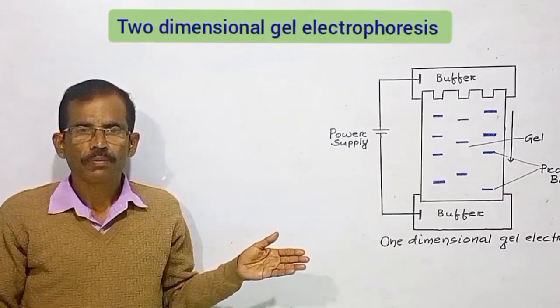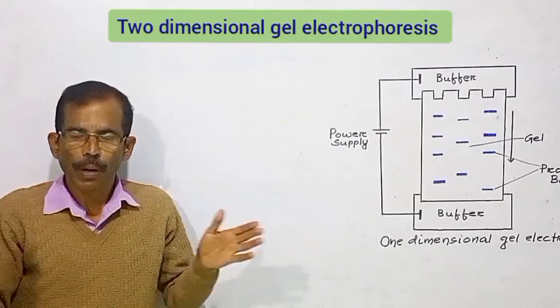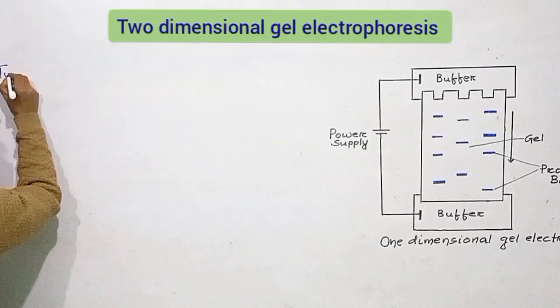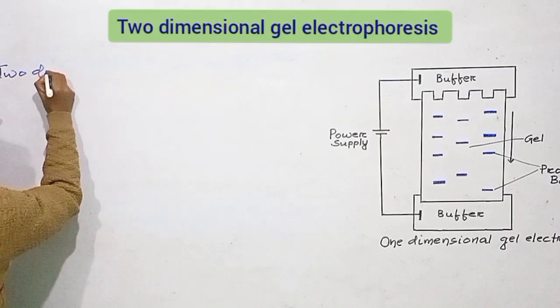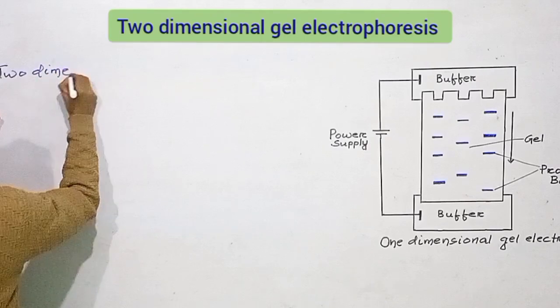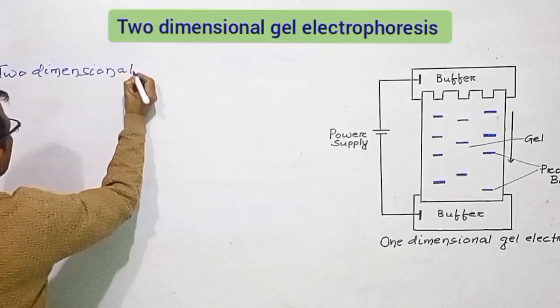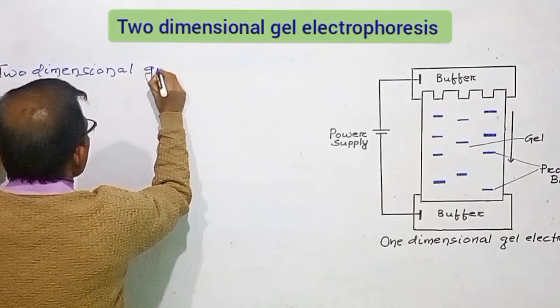All these problems can be overcome by a powerful technique called two-dimensional gel electrophoresis.